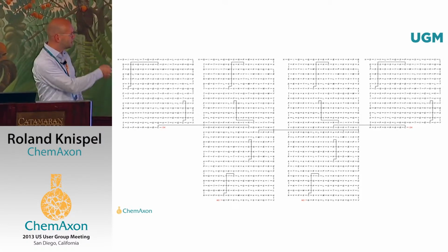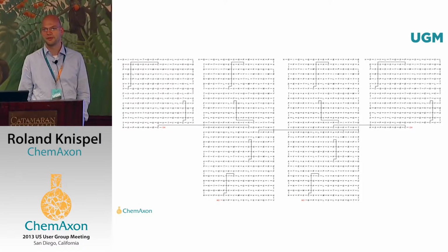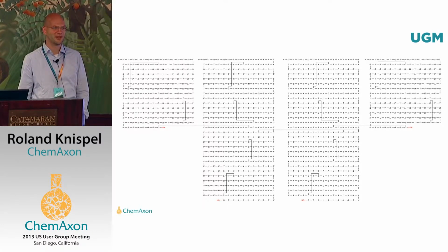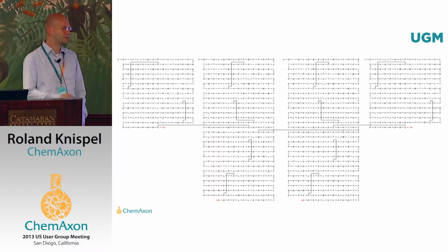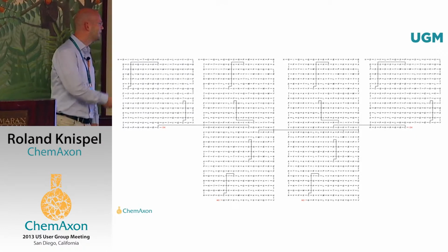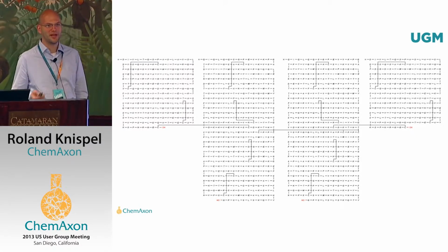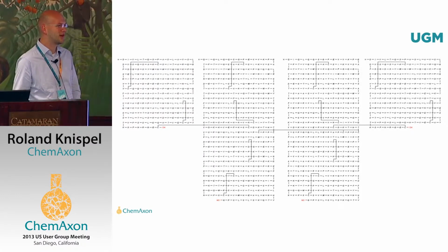And the entire structure here, which you've seen in the first image, was actually drawn by Marvin. The 2D clean of the entire structure ended up in the result you have seen here. It takes about 2 to 3 minutes to calculate this. And this is the kind of condensed representation when you're using the individual amino acid residues as superatom groups.